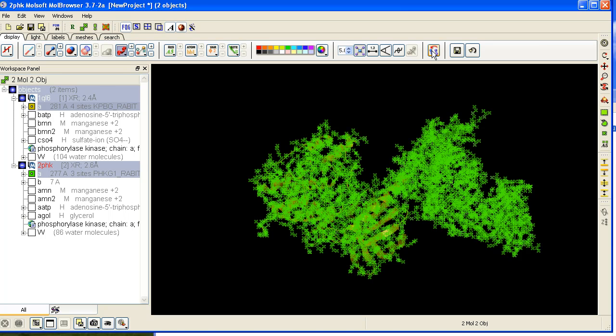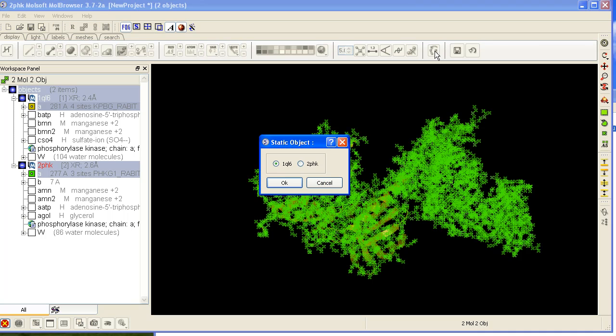Then go to the display tab and click on the superimpose button. Select which object you would like to remain static and press OK.